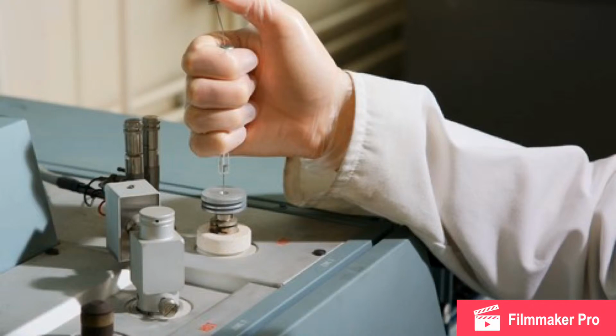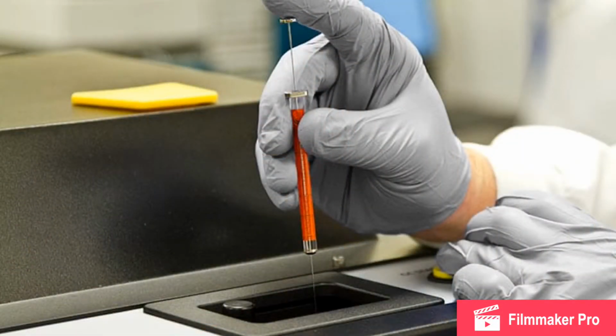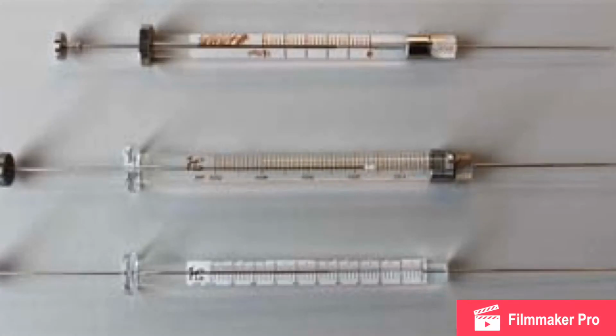Most injection techniques often employ the use of heated sample ports through which the sample can be injected and vaporized in near simultaneous fashion. A calibrated microsyringe is used to deliver a sample volume in the range of a few microliters through a rubber septum into the vaporization chamber.